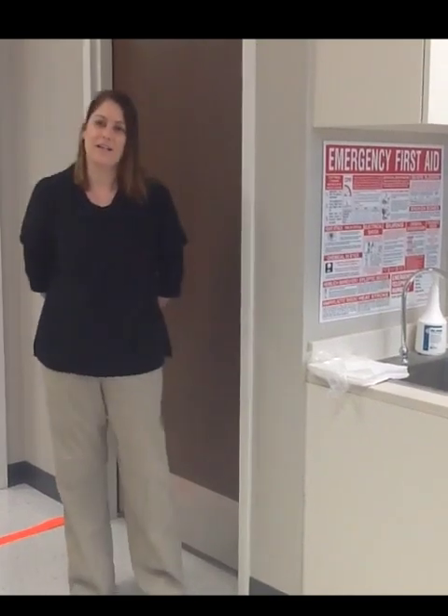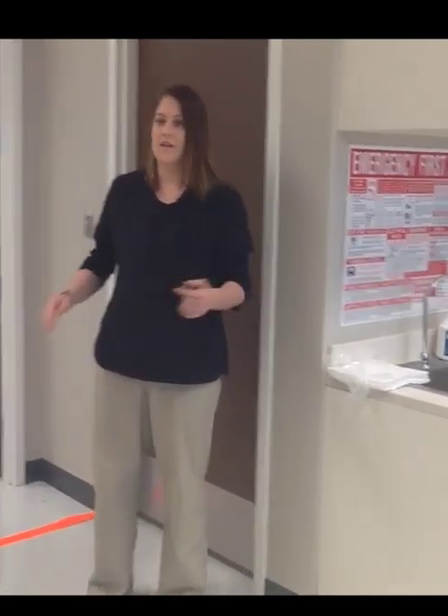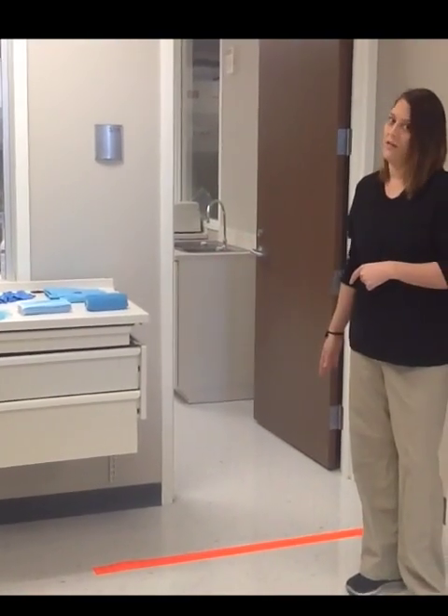Here we are in our ISO Class 8 ante-room. We have our sink where we will be washing our hands, our garbing area where we have our garbing materials, and our demarcation line.